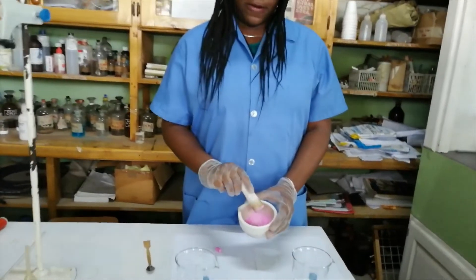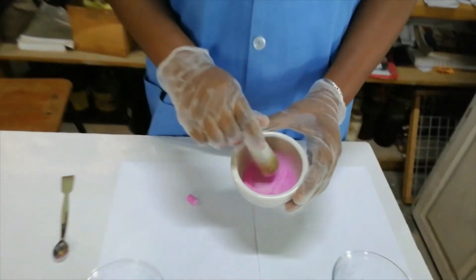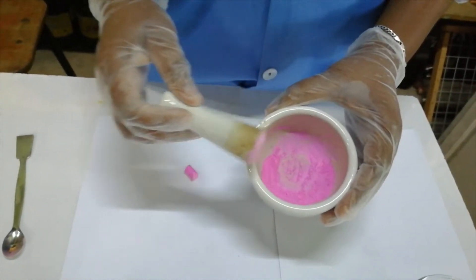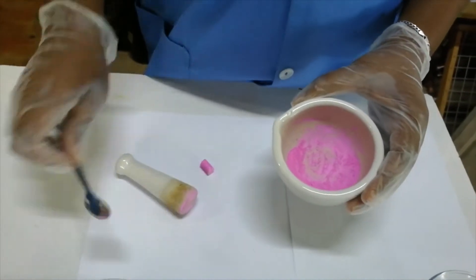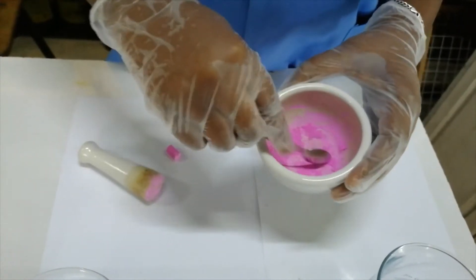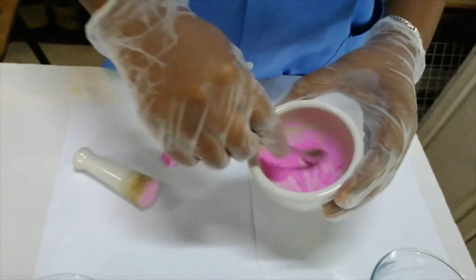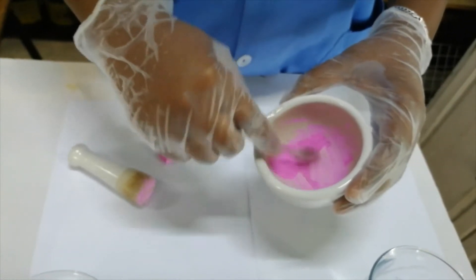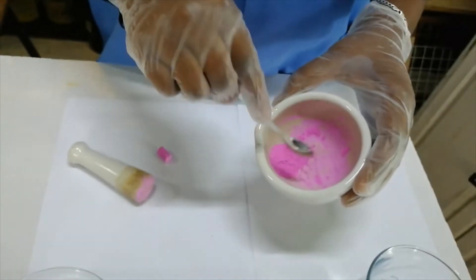We have crushed one half of the chalk, and now we're going to use a spatula to gather all the particles together so that we can transfer it to the glass beaker. Remember that this crushed chalk was basically the same size as this whole piece.